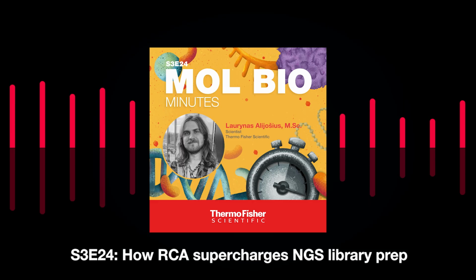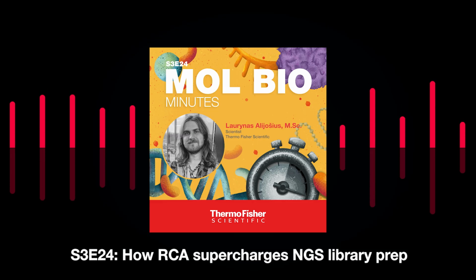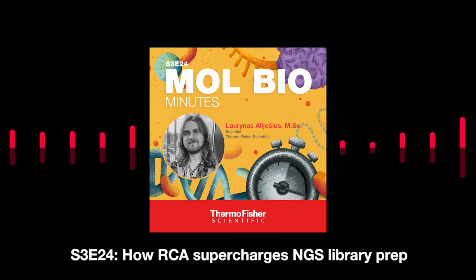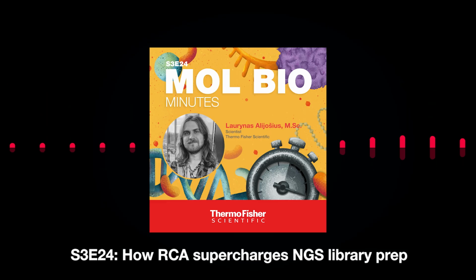So both RCA and whole genome amplification are part of the MDA family. Whole genome amplification is used when amplification occurs from linear templates, such as linear genomic DNA, while RCA is used for circular DNA templates, such as plasmids, viral genomes, or ligated DNA molecules. Think of the circular DNA genomes of the viruses I was working with, that I told you about in the story previously. That could be a good example.